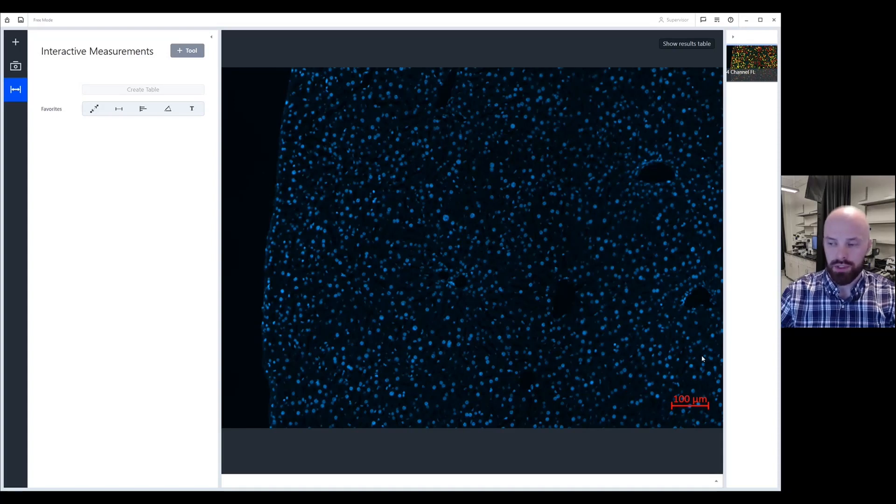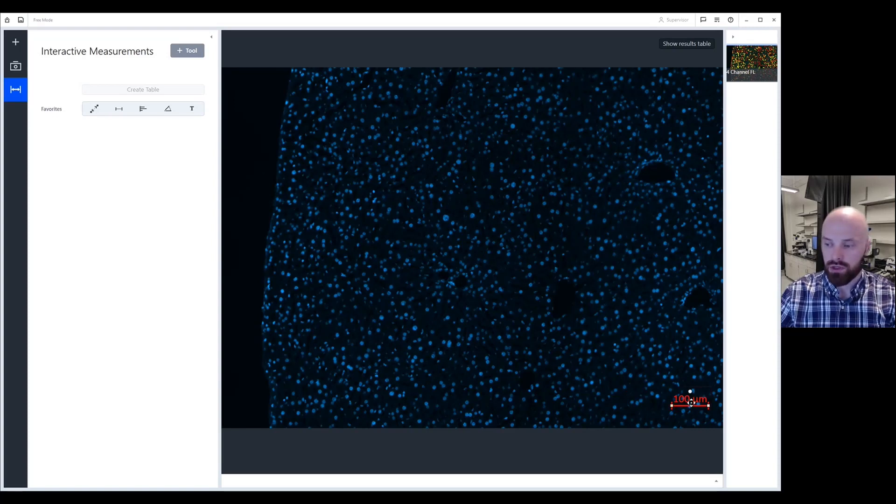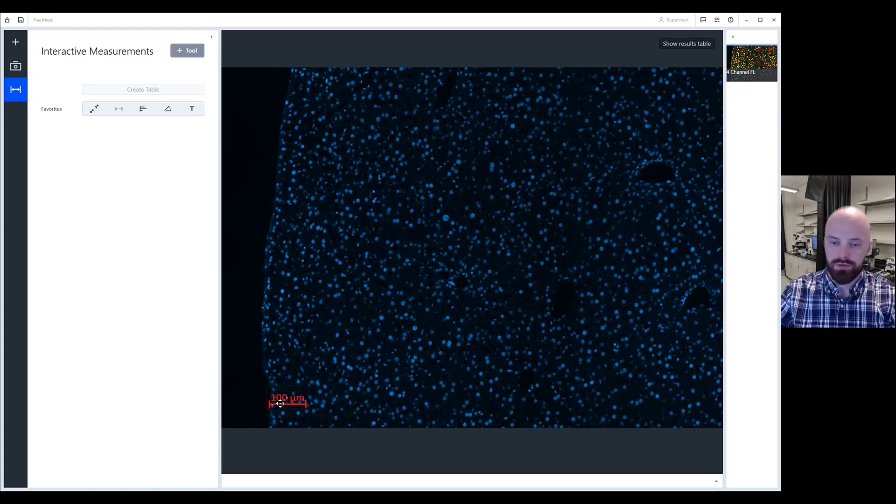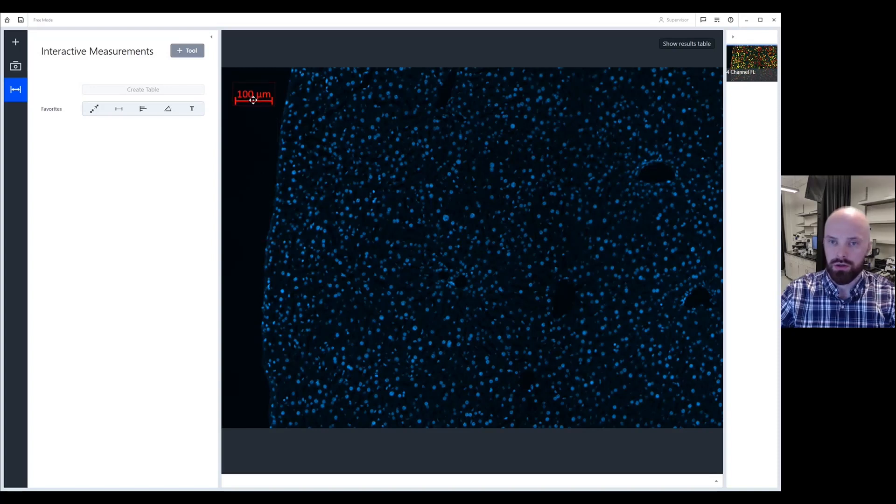If you would like to change the position of the scale bar, simply click on your scale bar and if you click and hold, you can actually drag this scale bar to a different location anywhere on your image.